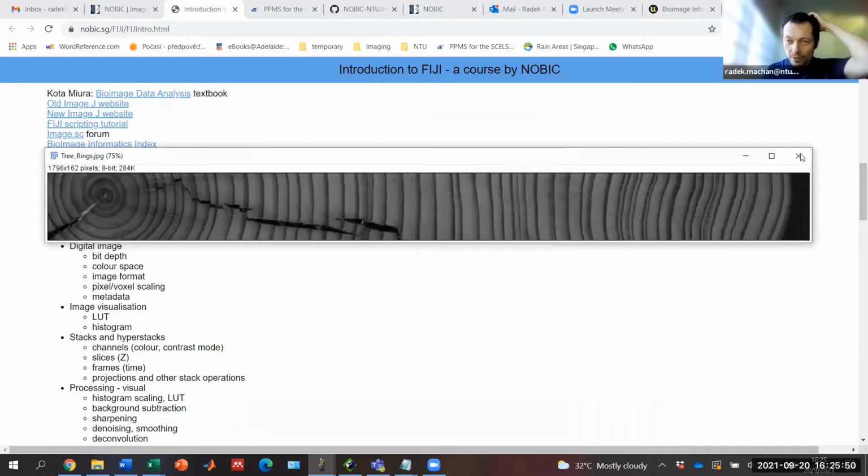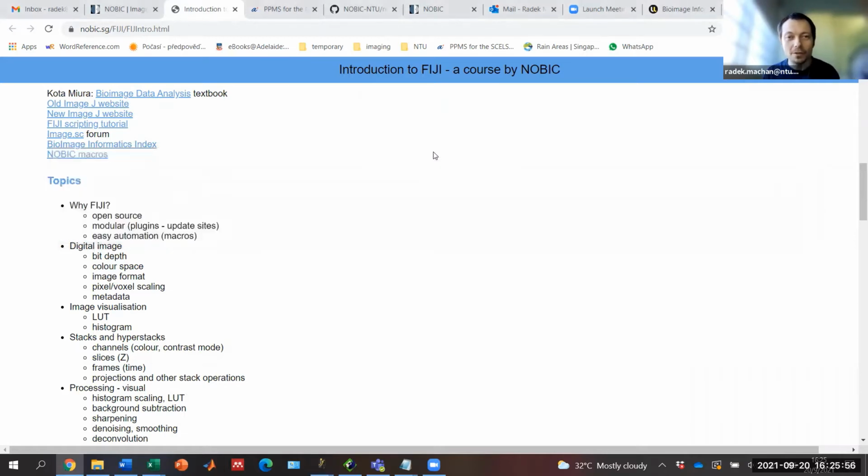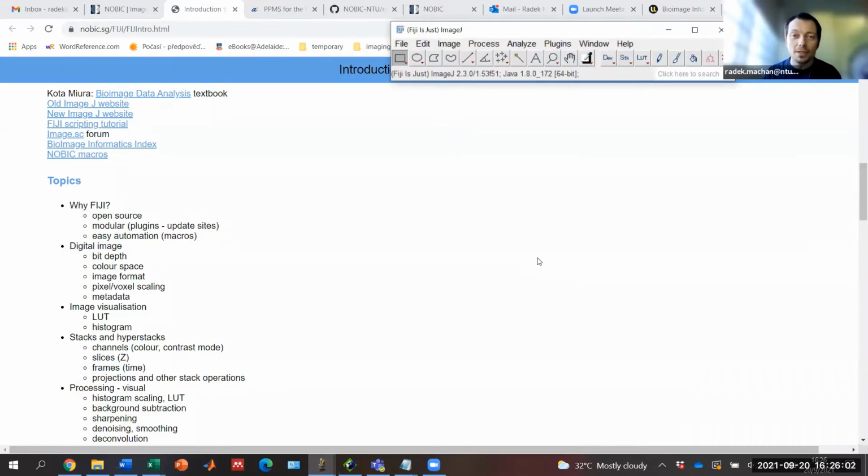So that's for Fourier transform. And maybe it's a bit not so intuitive, the Fourier transform, but it is quite interesting for image processing, and if you want, you can try to play with it, and you might find that it can do quite interesting things. And the next topic, a big topic, and one of my favorite topics in image processing and analysis, is colocalization analysis.